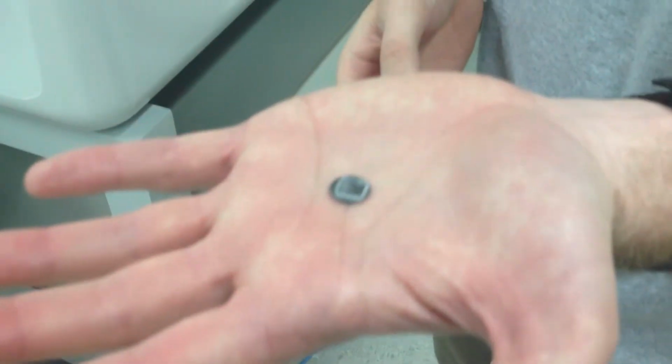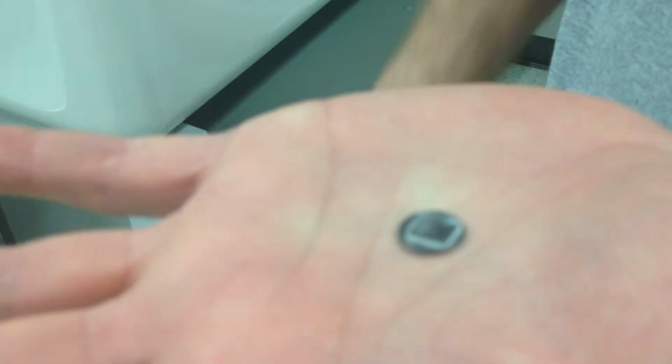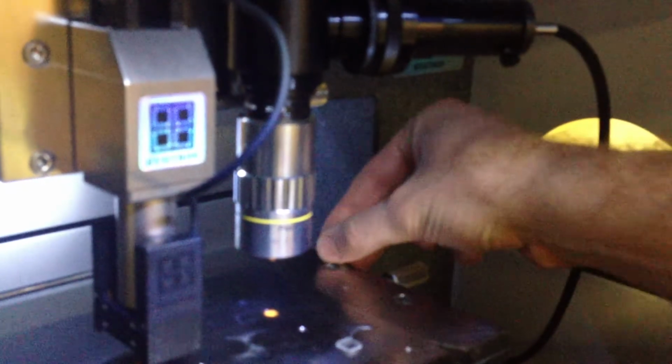There's another one of these standard samples in here on the stage, just like the aluminum sample was. And you can see it's just a piece of quartz that's glued to another one of these magnetic mounting pieces. So what we'll do is we'll take this and put it on the stage somewhere until it snaps down. You took already the aluminum sample, right? Yeah, the aluminum sample I just put over here to the side. And so here's the quartz sample.